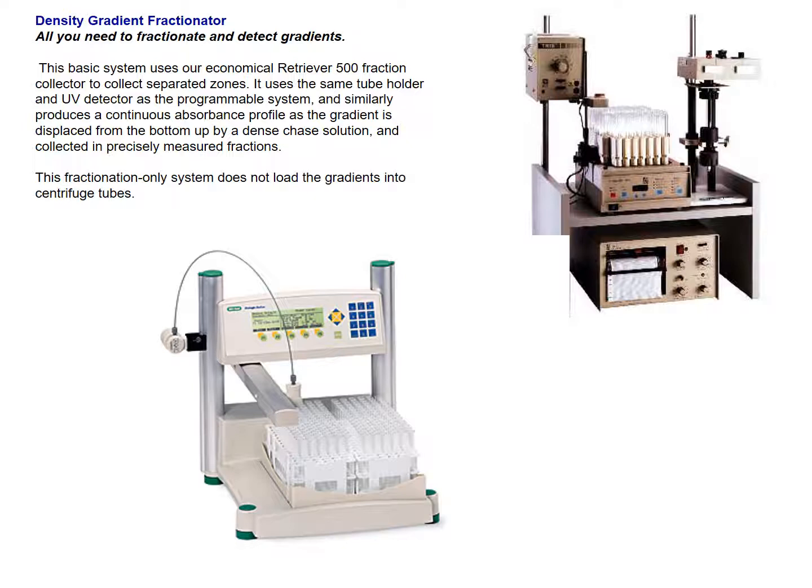Yeah. So you pretty much have to watch this, and a lot of times this is done in a walk-in cold room, 4 degrees. So you have to wear your parka and you jump in and out to make sure this thing is moving. And remember we added the protease inhibitors, so they should still be working as well. Okay. So this is after the centrifugation, not before. This is after, and we end up with fractions.